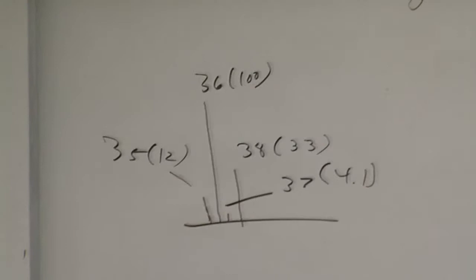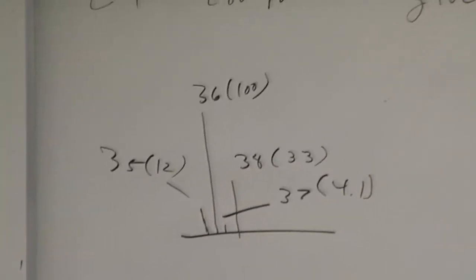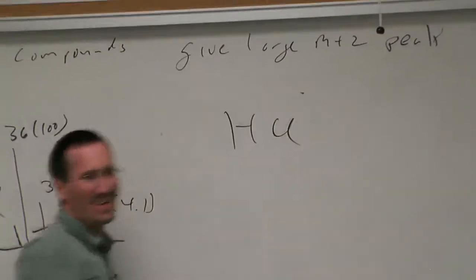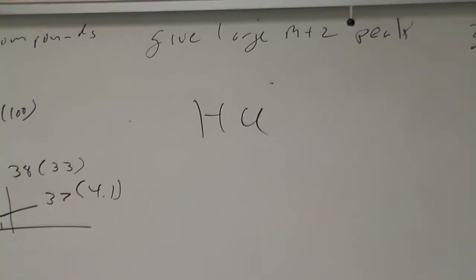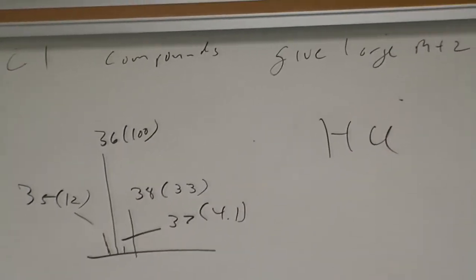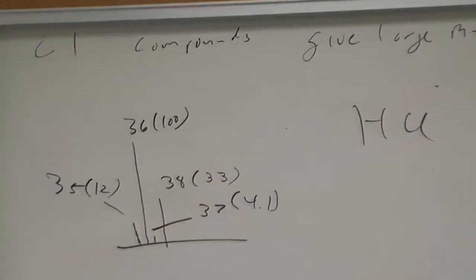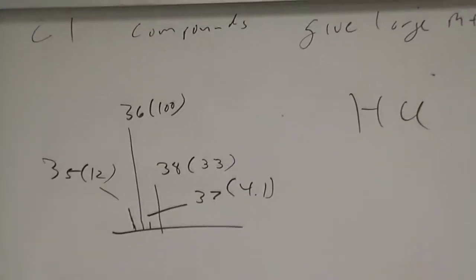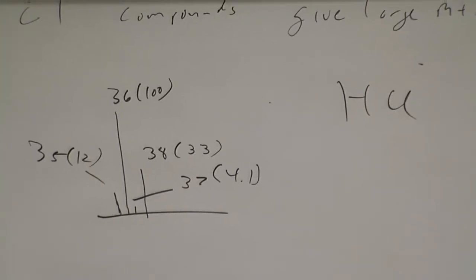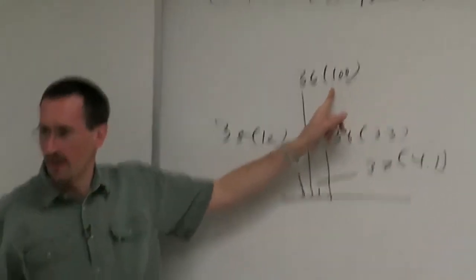Who am I, right? This is the game, who am I? HCl. Got it? Now explain it. You see small peaks of chloride. All right, so let's start with the big guy here. What's the big guy?